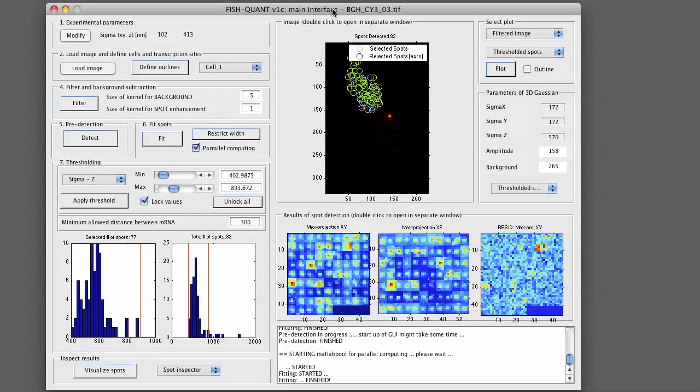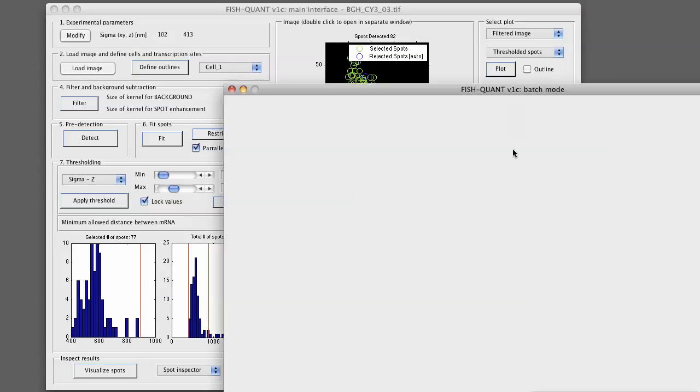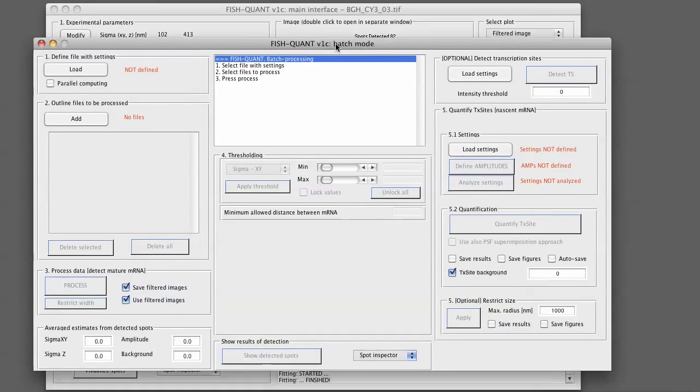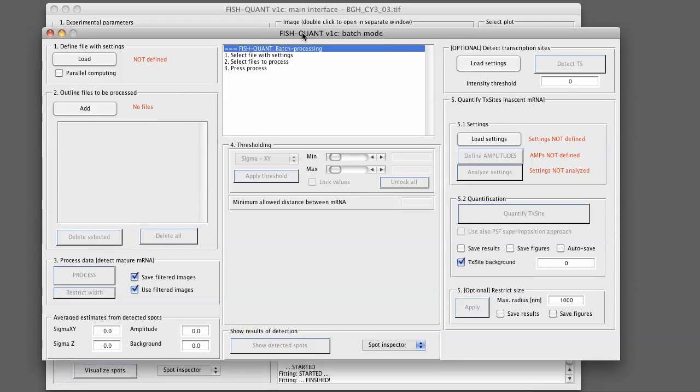In order to go to the batch processing you go to FishQuant in the menu to tools and select batch processing. This will bring up another user interface. We can perform various batch processing modes. For now we focus on the mature mRNA quantification but in the same interface you can also perform the detection and the quantification of transcription sites.